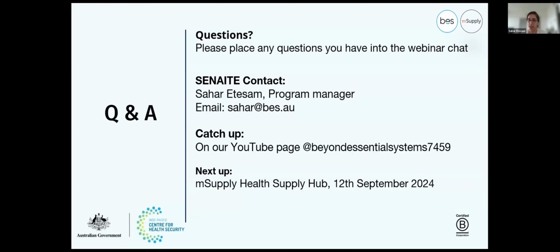And for the last question, how do clinicians get notified out of SENAITE? If Tamanu is not used, you can get the report by email from SENAITE, or you can get it as a PDF report by email if we can add the emails of the doctors into the system so they can receive the result through that as well.